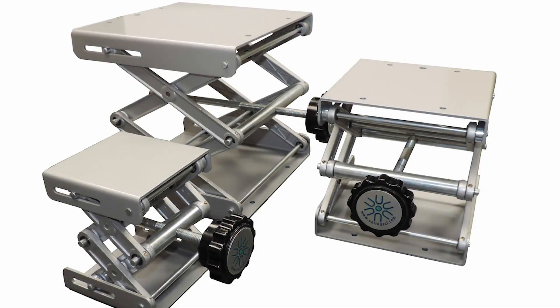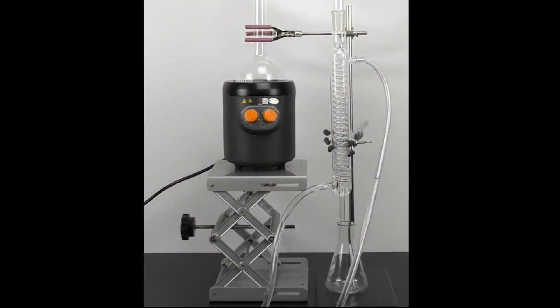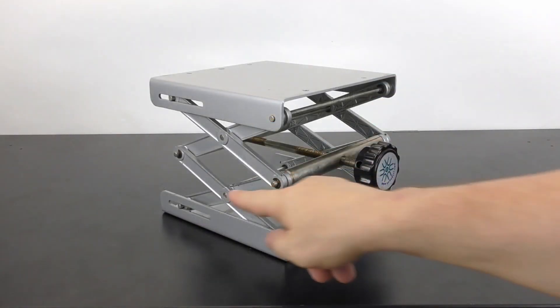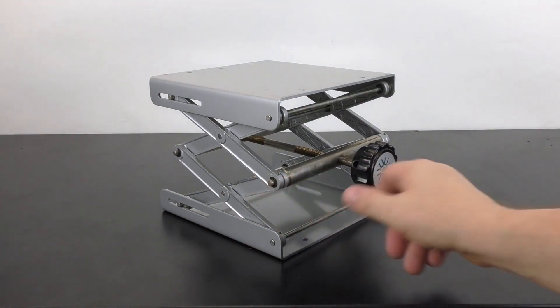With all the different sizes of labware, a good lab jack is a necessity. Constructed of aluminum and steel, they are durable and hold anywhere from 22 to 55 pounds depending on the model. One example where a lab jack is very useful is when you're using a heating mantle with a distillation apparatus.